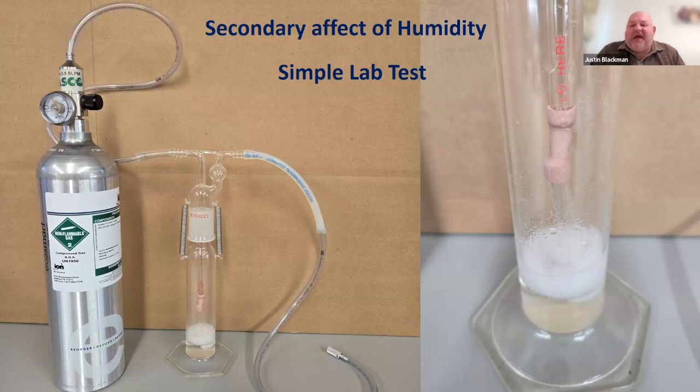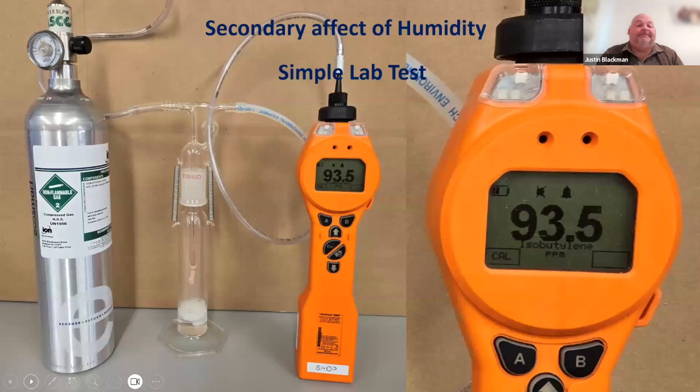The gas will pick up as much humidity as it possibly can based on the temperature and the air pressure in the room right now. But it will absorb what it can to get close to 100% humidity. We can then connect our instrument to that and see how it reads.